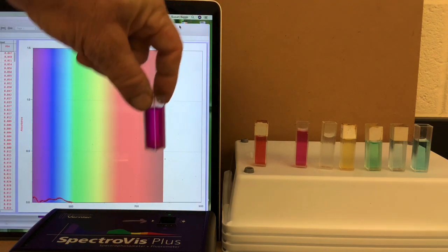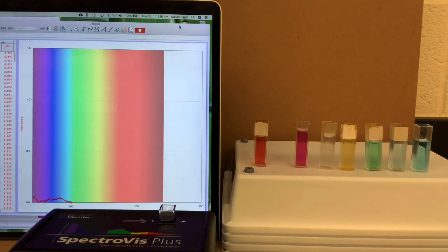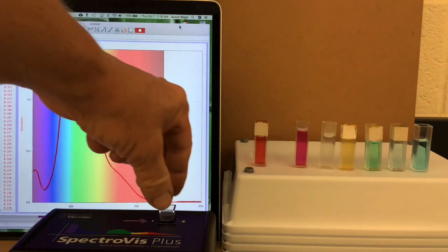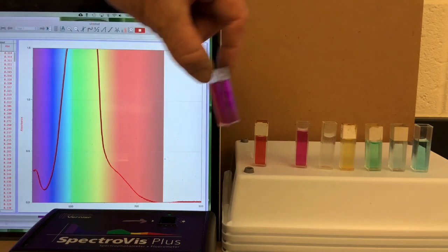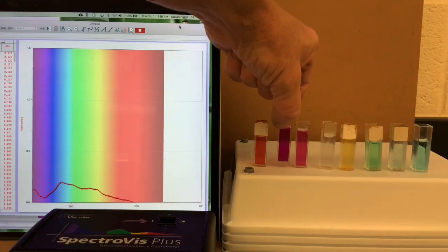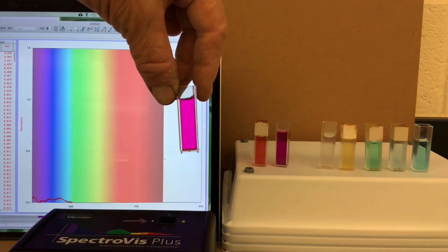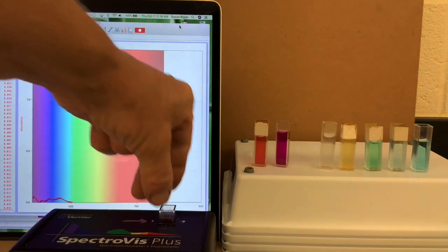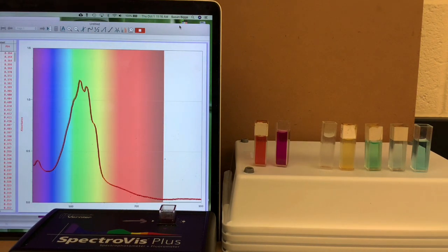Next, permanganate. Fairly concentrated. Notice that there is a lag time. We have to wait two or three seconds for the spectrophotometer to actually record the absorbance. Here's a little bit less concentrated permanganate. That fits better on the scale. There it is.